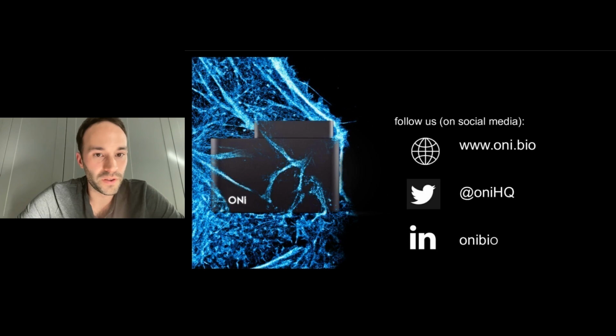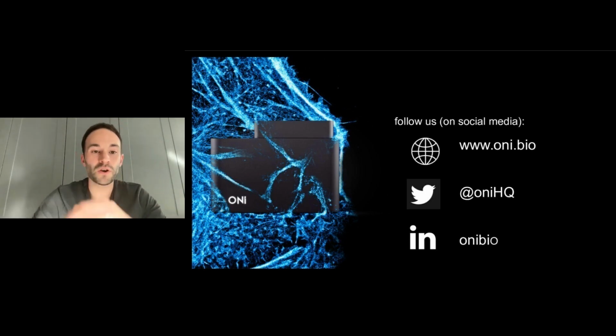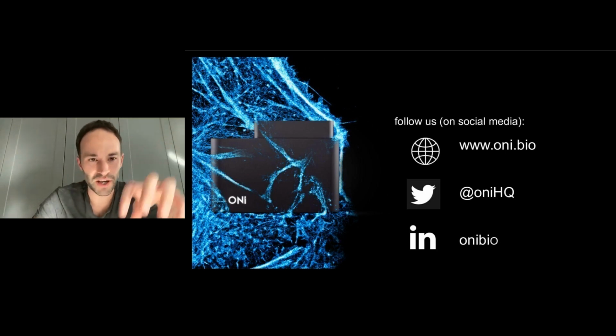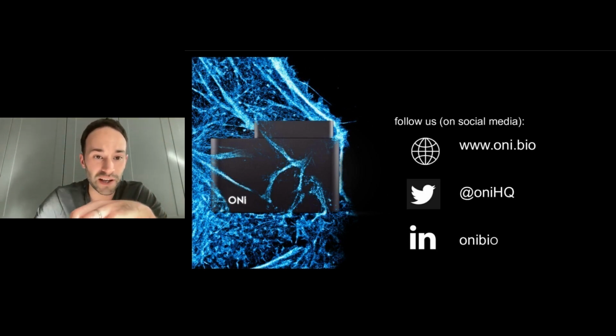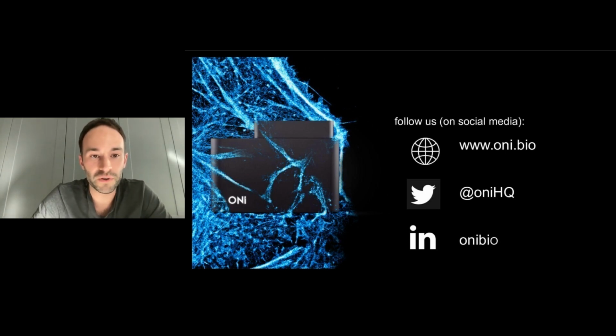The problem with many lymphocytes is that essentially you put them on any hard surface, they start to activate. And this is due to the size-dependent segregation of molecules at the cell surface. So, for example, CD45 is a very large phosphatase. As soon as the cell starts to come into contact with a glass surface, for example, if it's been coated by poly-L-lysine or something like that, the CD45 gets pushed out simply because it's large. And because it's a key regulator of molecules on the cell surface, that then changes their behavior.